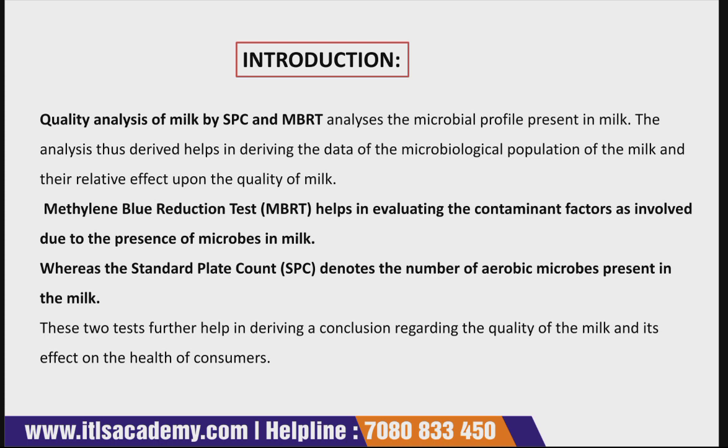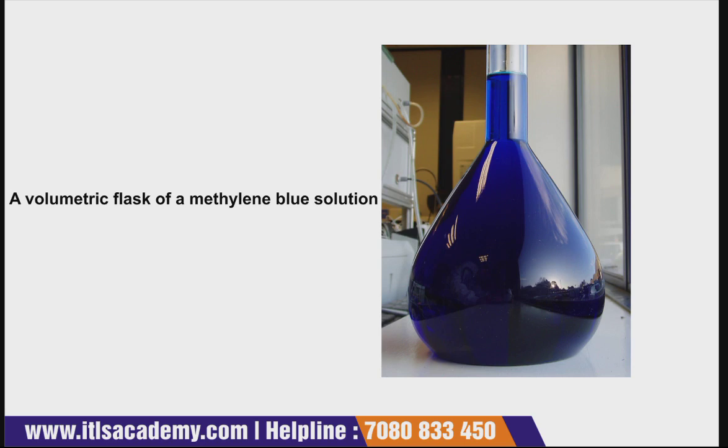The sooner the color decolorizes, the poorer the microbial quality of the milk. On the screen, there is a figure that shows a volumetric flask of methylene blue solution.